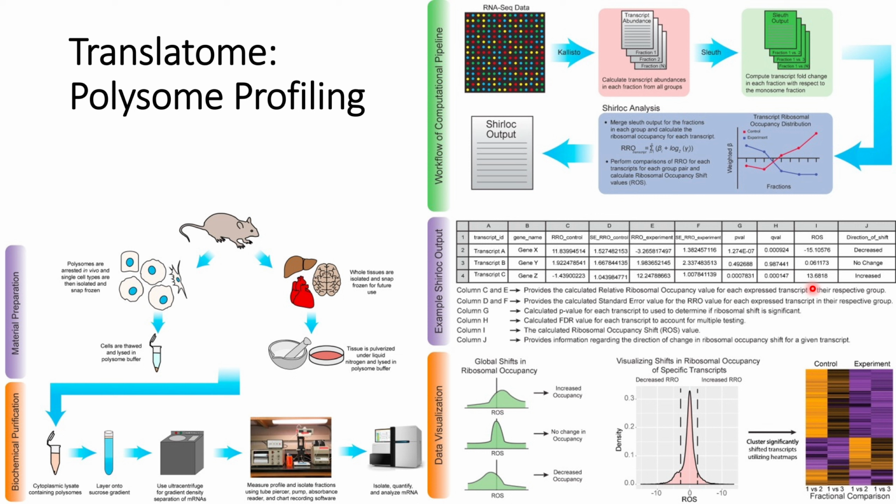If the values are positive, very high, greater than zero, then it is considered that there is an increase in the mRNA translation. If the value is too low, such as in this case -15, then it is considered that there is a down regulation of the mRNA translation. If the value is close to zero, then there is no change in the mRNA translation.